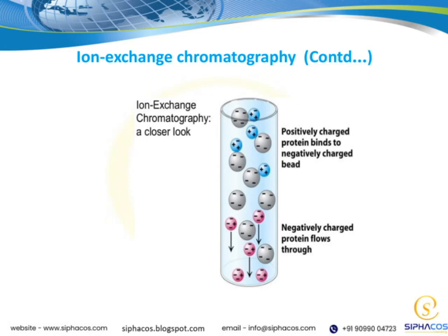Let's continue with our discussion on ion exchange chromatography. As we've seen, this technique is a powerful method for separating and purifying ions and charged molecules. It relies on the principle of oppositely charged ions attracting each other, which allows us to selectively bind target molecules to a resin or resin bed.